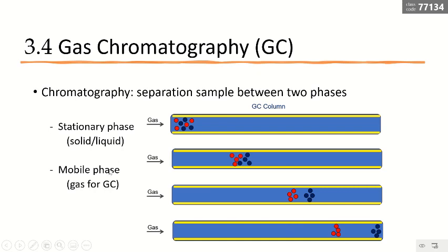The mobile phase you can consider as the air or the water flow, something that can help you move in your favor, help you move out of this track. That is normally the example I provide in my class for what this separation means.